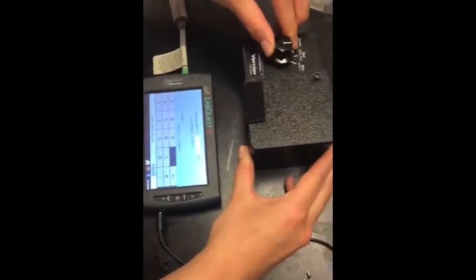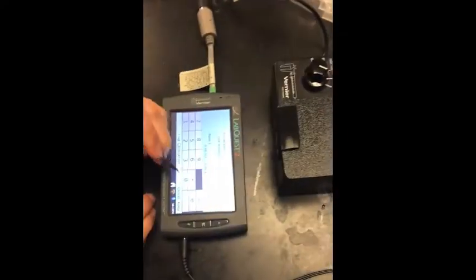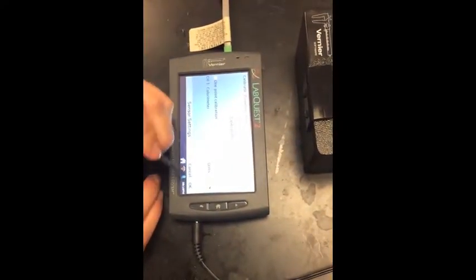Next, turn the dial to 470. Then on the lab quest, enter 100. Then press keep.